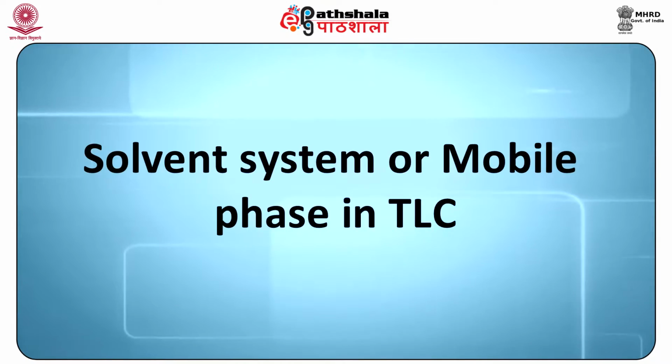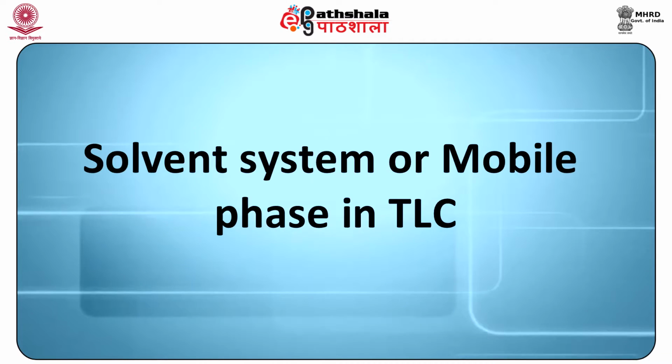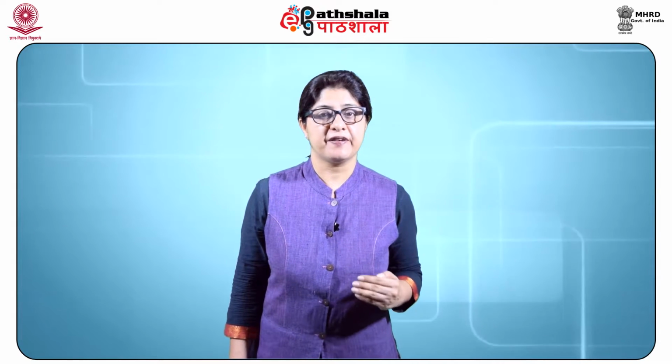Solvent system or mobile phase in TLC. The mobile phase is liquid in thin layer chromatography. The mobile phase is usually a combination of 2 to 5 different solvents selected empirically using the trial and error method, guided by prior personal experience and literature reports of similar separations.